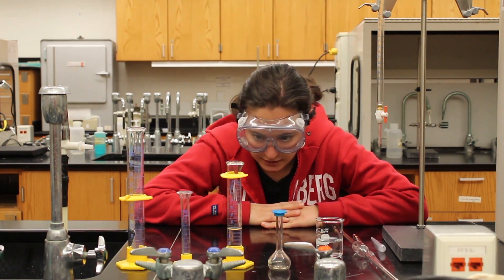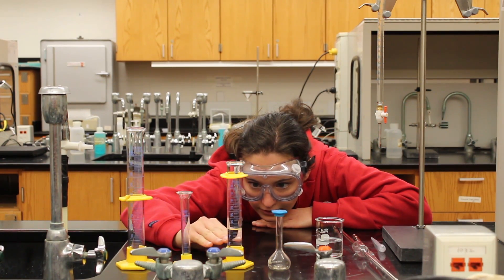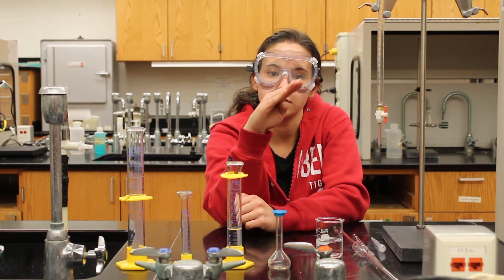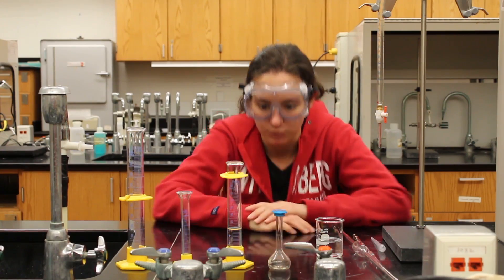When you take measurements, you'll want to have it on a flat surface and have your eye level right where the water is. Also when you're taking measurements, you want to go down to the meniscus, and that is where the adhesion actually bends the water down. So that is where your measurement will be.